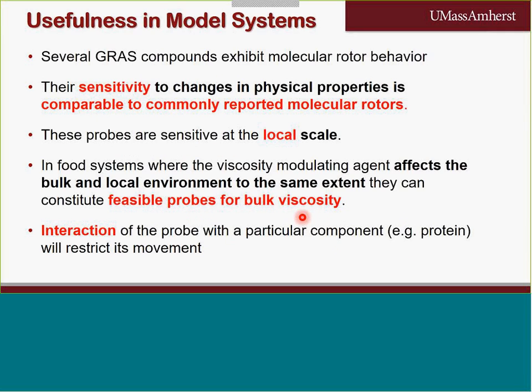We have to bear in mind that this sensitivity is effective at the local scale, of course, because they are molecular probes.